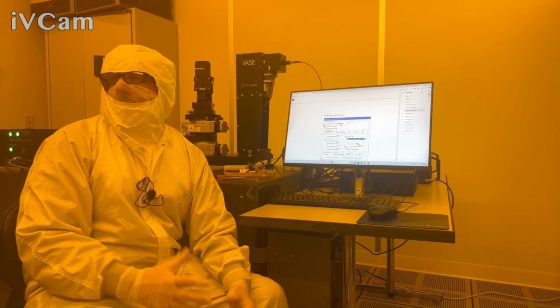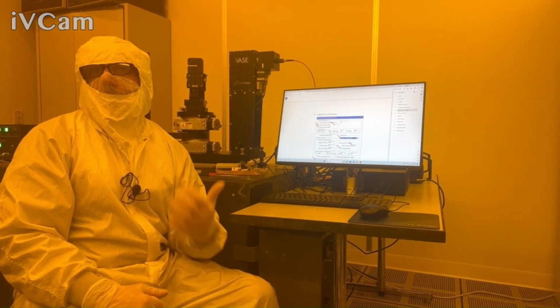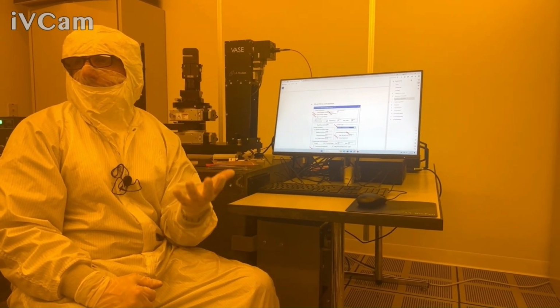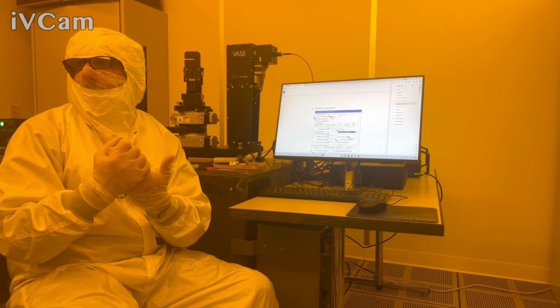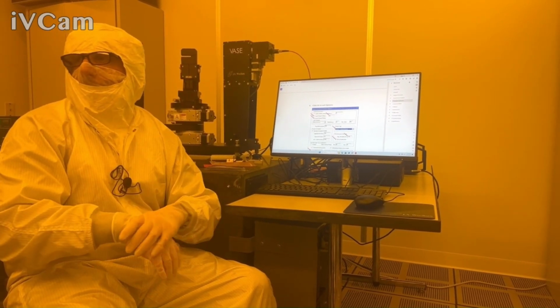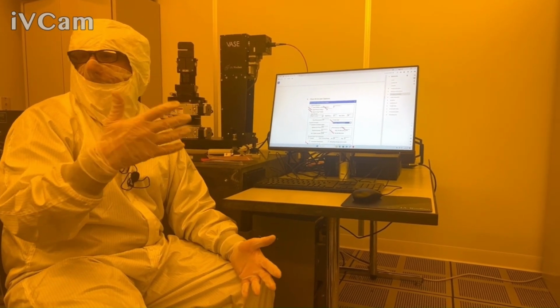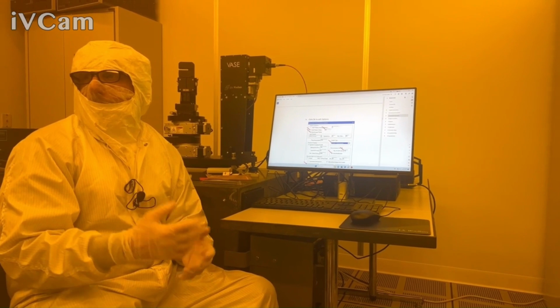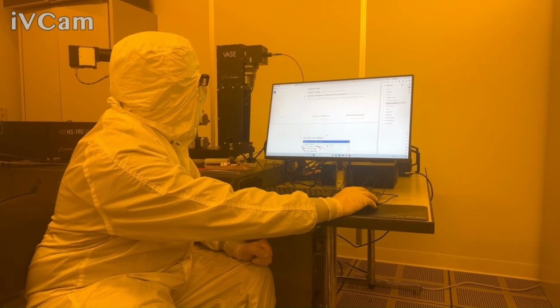Well, a reflective scan can also give you where those absorptions are, but we're also going to be very surface sensitive. What's your oxide, what you're growing on top of it, things like that. There are other ways to get similar information. Sure, I'm just giving an example where you might want a finer resolution. Or what's your composition, if you have silicon germanium or something like that, right?